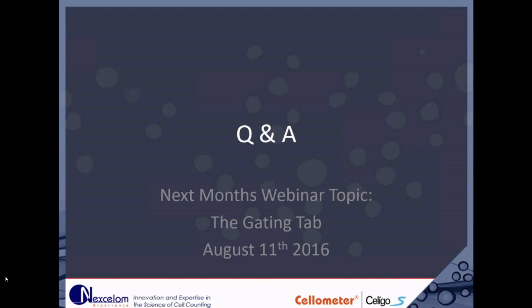I'm not seeing any questions coming through, which could be a good thing. It's a lot of information. I think the one thing that surprised me that I learned today was you can use a fluorescent algorithm if you're looking at a bright field image. I think that was not intuitive for me, so I thought that was really helpful.